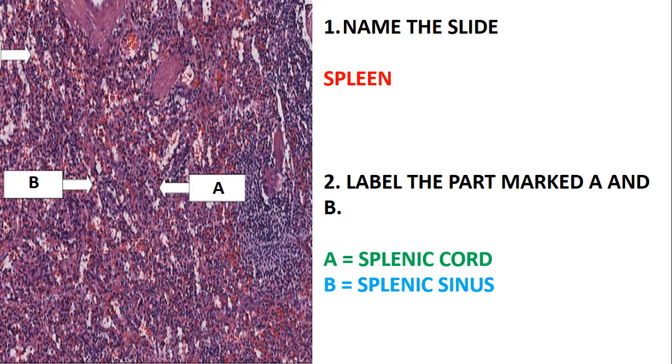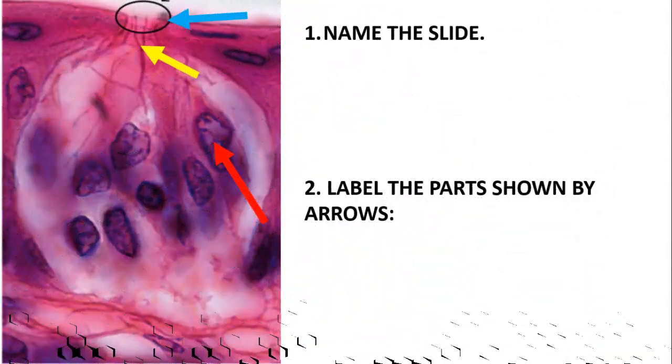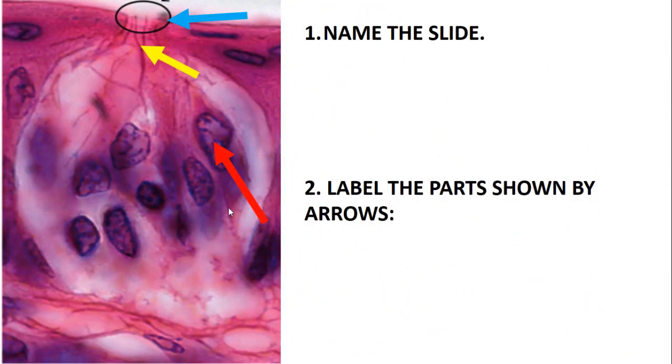Okay, let's quickly move on and look at the next slide. Name the slide. This slide is taken from the tongue, and they have specifically projected the taste bud. So you can put tongue and then the taste bud.